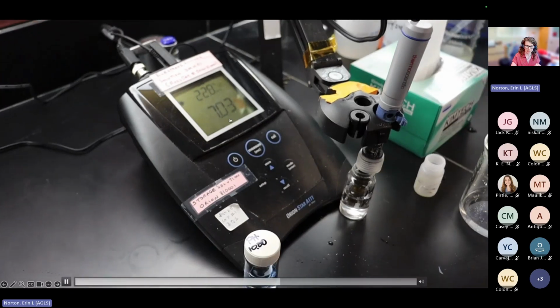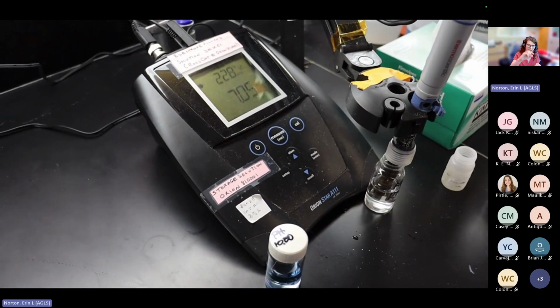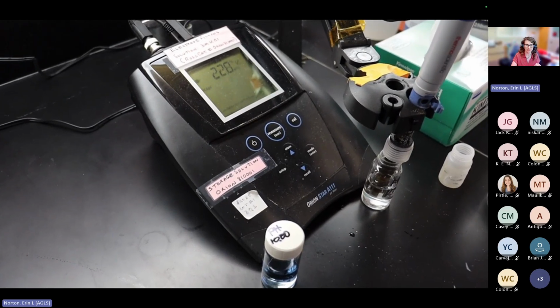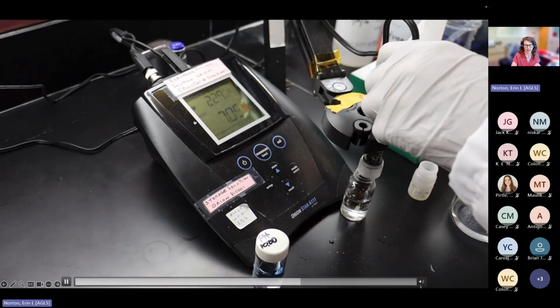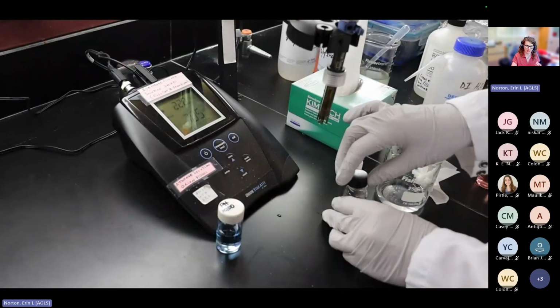That's going to read. Our particular pH meter will say ready, or will stop flashing when it's stabilized.